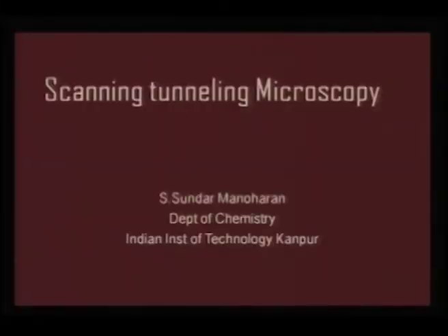In the microscopy techniques we will be specially looking at the range of methods that can be mapped under microscopy, namely scanning electron microscopy, transmission electron microscopy, scanning tunneling microscopy, and atomic force microscopy. All these are basically imaging techniques. They are quite different from the spectroscopic tools, but it is impossible to cover all this in one lecture.